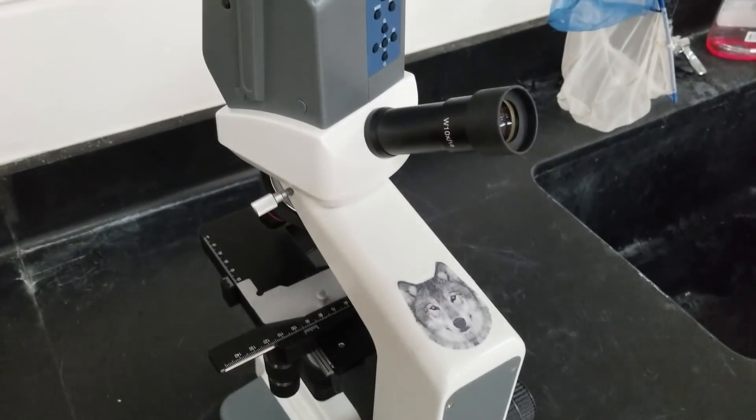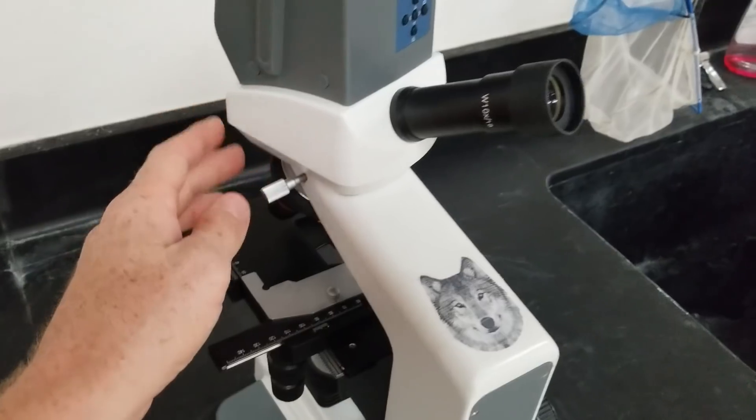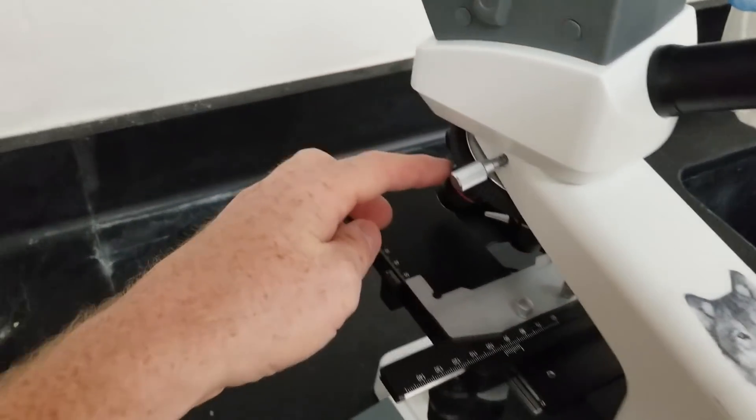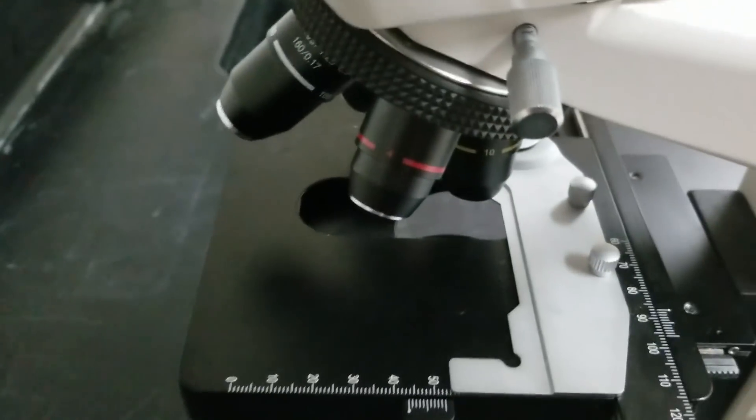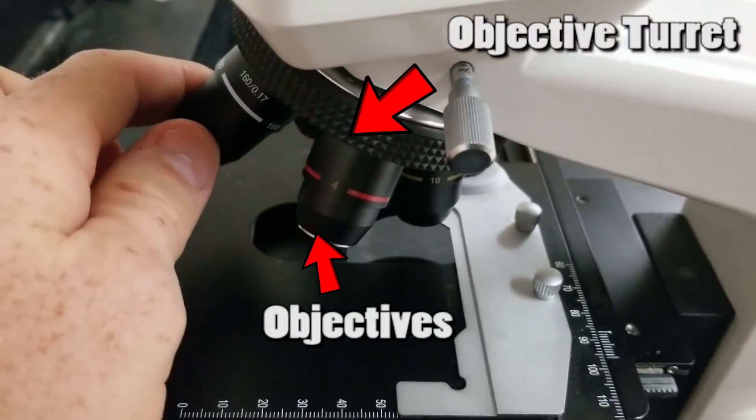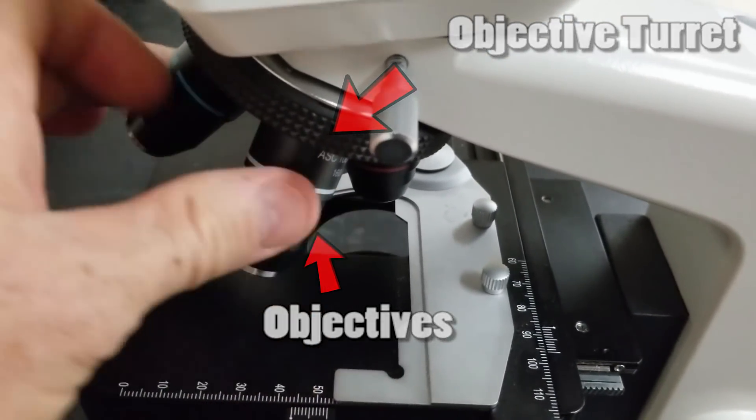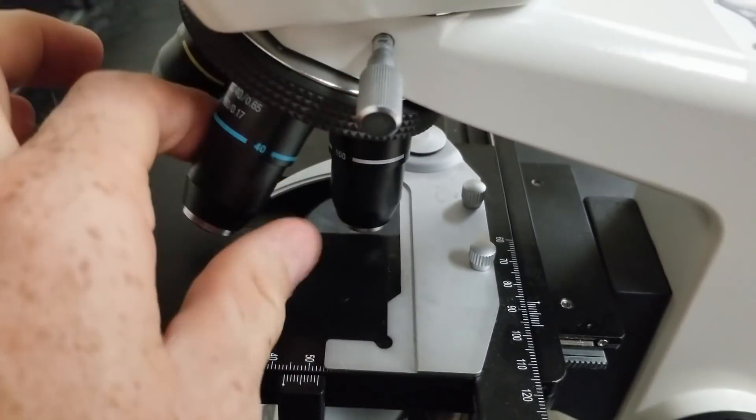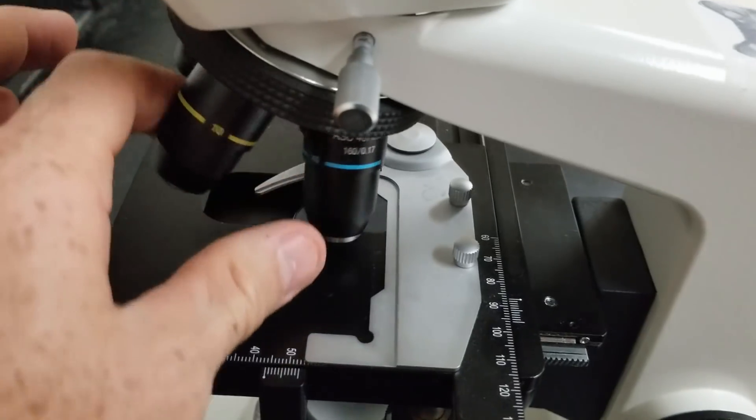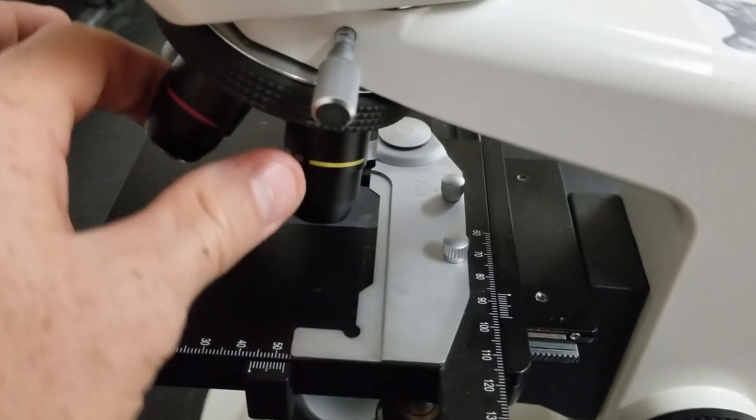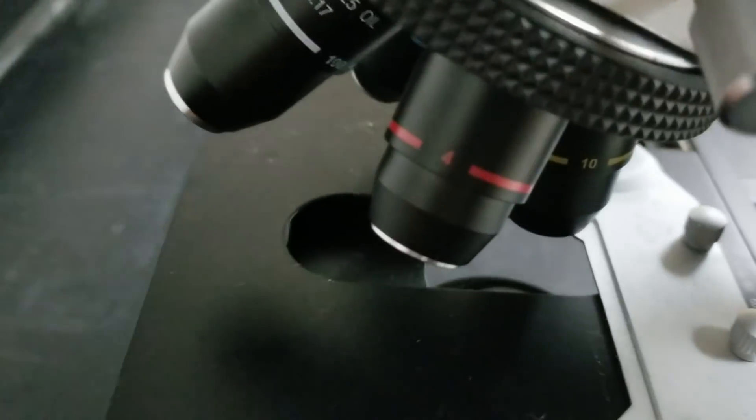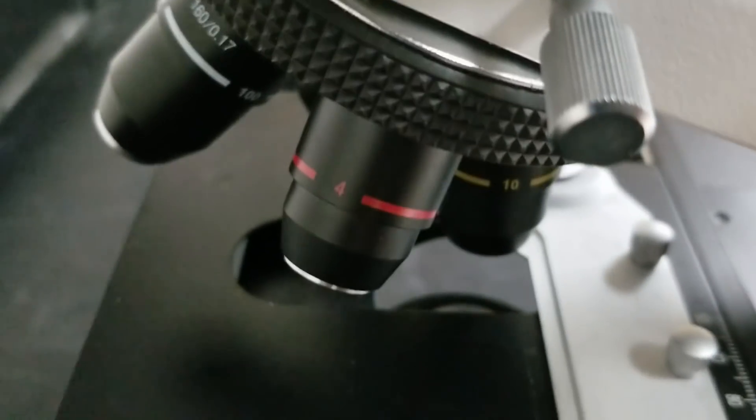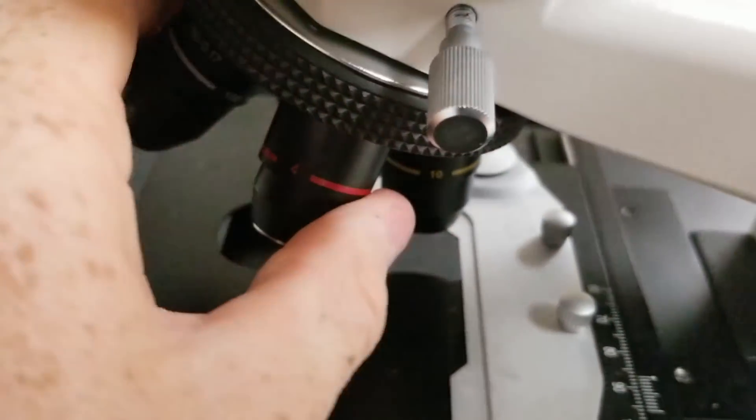As you move down past the head you go to the objectives. The objectives are what you use to change the magnification. The shorter ones are less magnification and as they get longer it's more magnification. You can see the magnification on the side of the objectives.